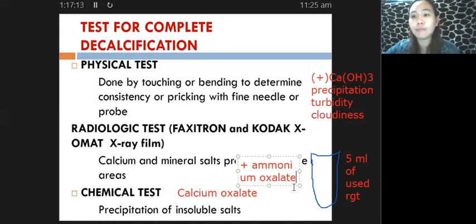Did you get it? Did you understand? We should understand this. All right. So in your module, if you go back to your Perenyi's fluid, there is a modified form, or a modified chemical test, that we perform in the case of your Perenyi's fluid.